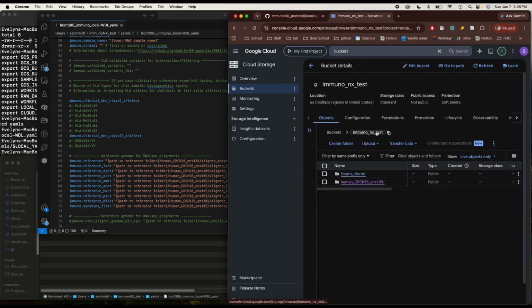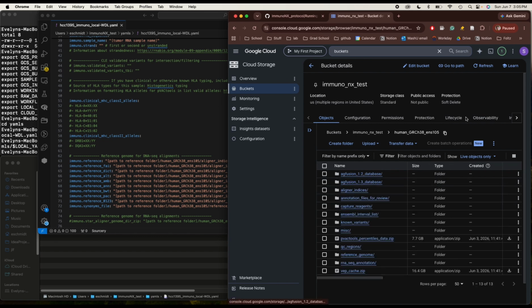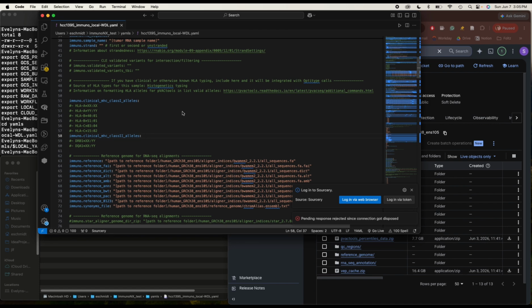So we can actually do it two ways. We can copy it with that little copy symbol, or we can, no, we can't do it that way. Okay, we'll copy it like this with that little copy button. And then we will do a find and replace.